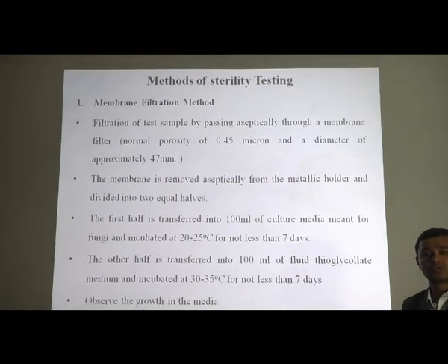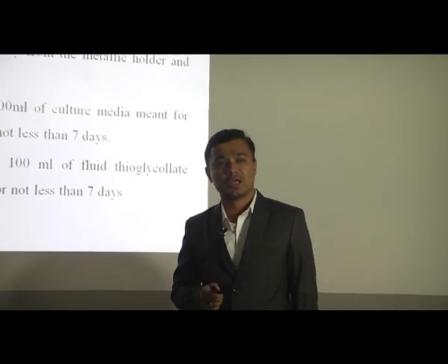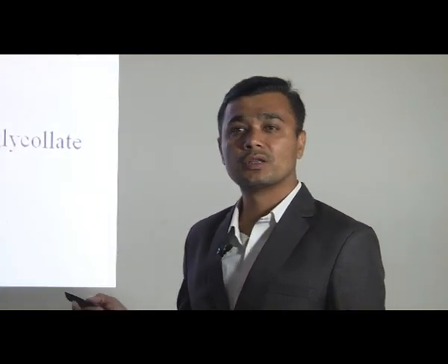Then the methods for sterility testing. Two methods are used: the first is the membrane filtration test and the second is the direct inoculation test. In the membrane filtration test, we use a membrane filter for the sterility testing. These steps are involved in the sterility test.